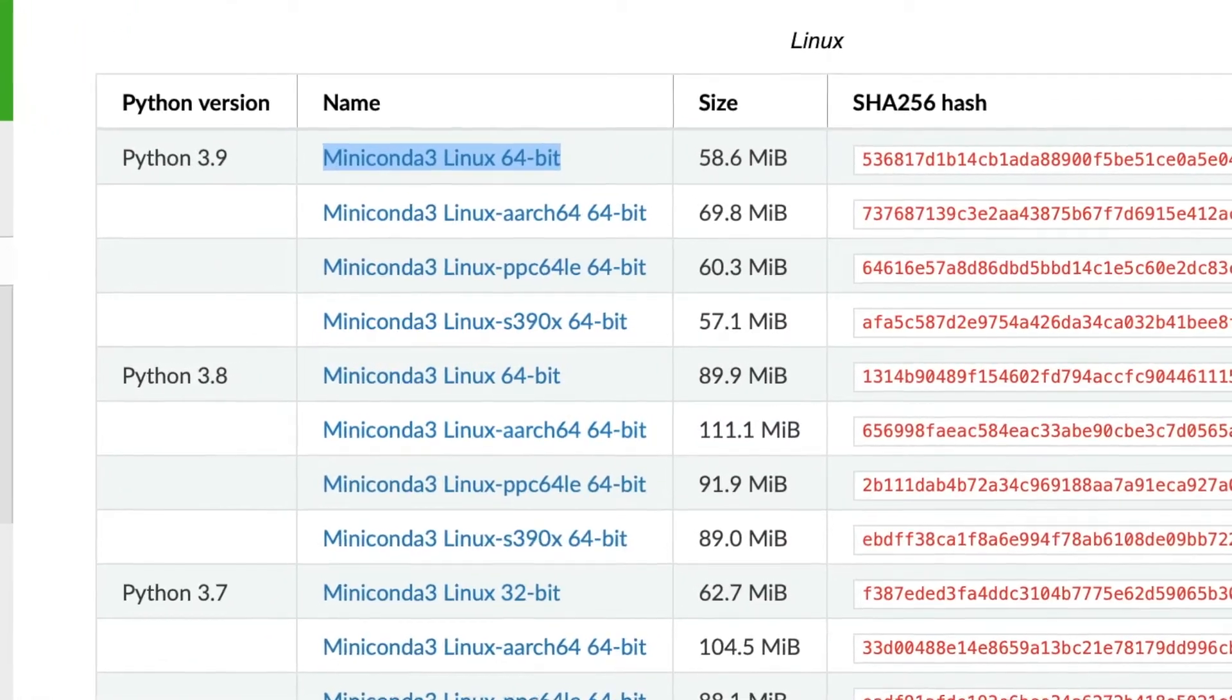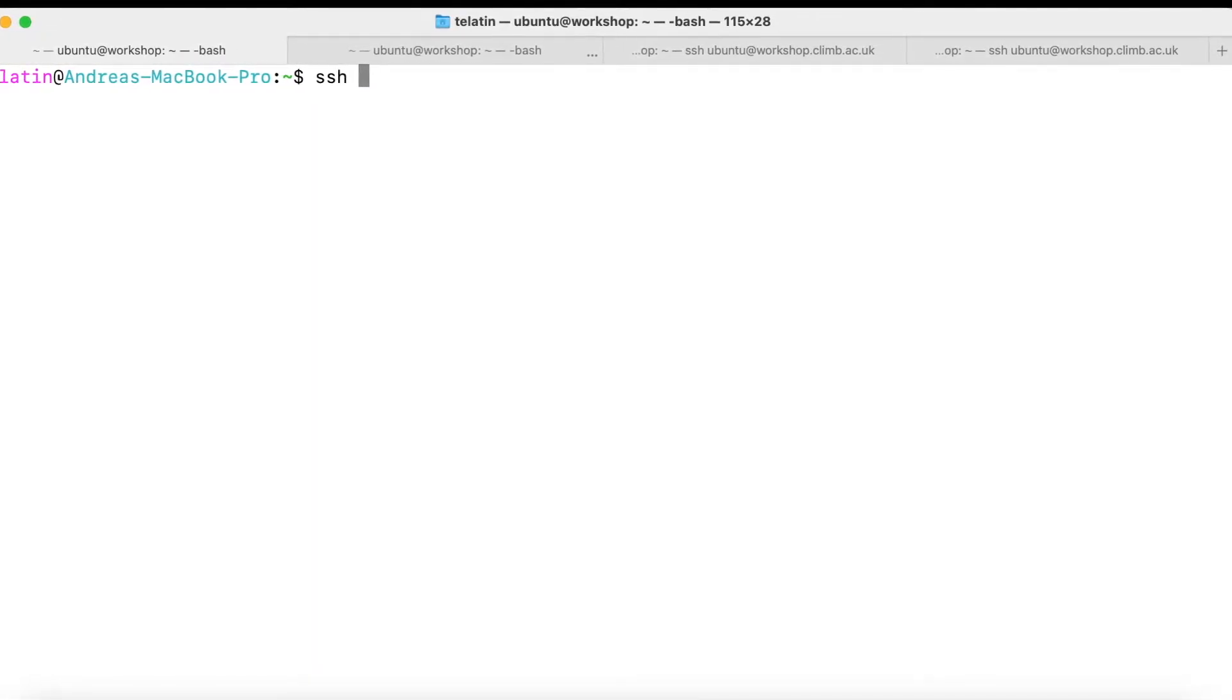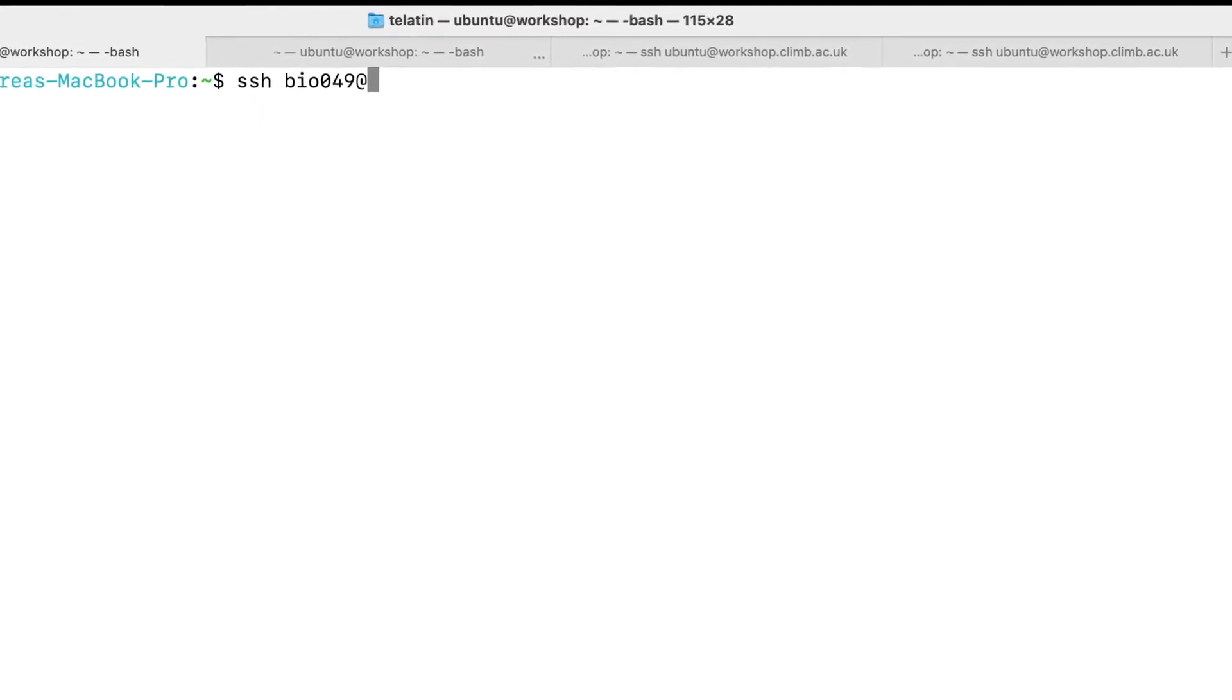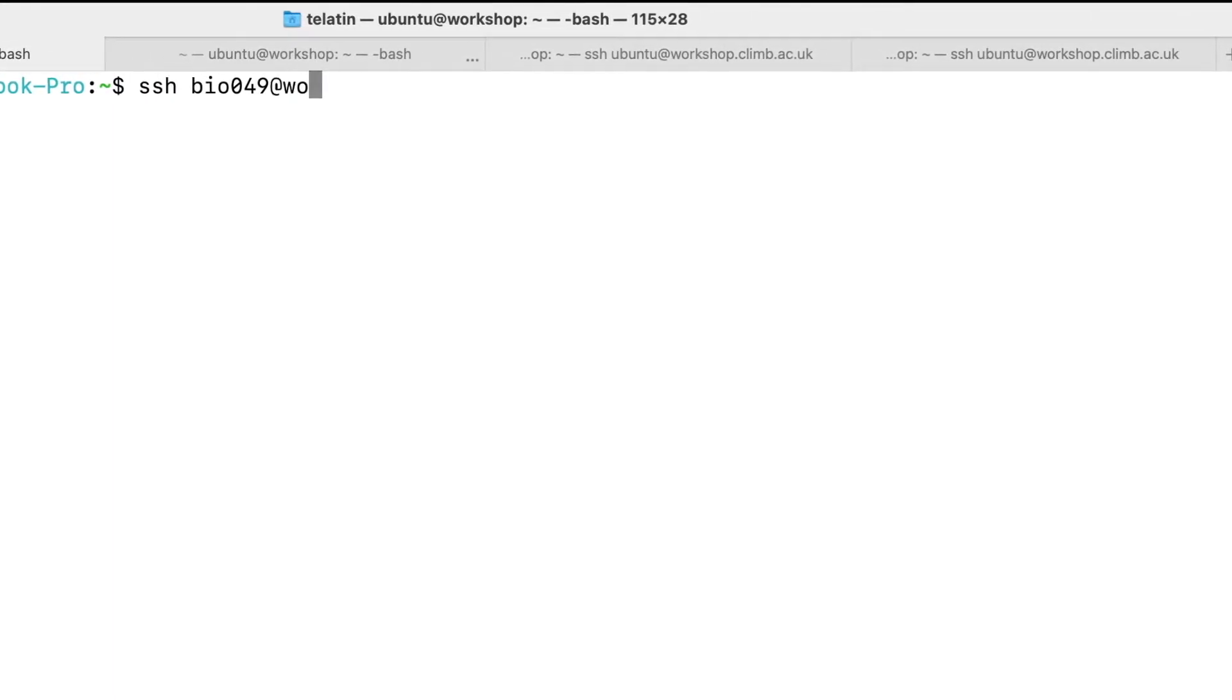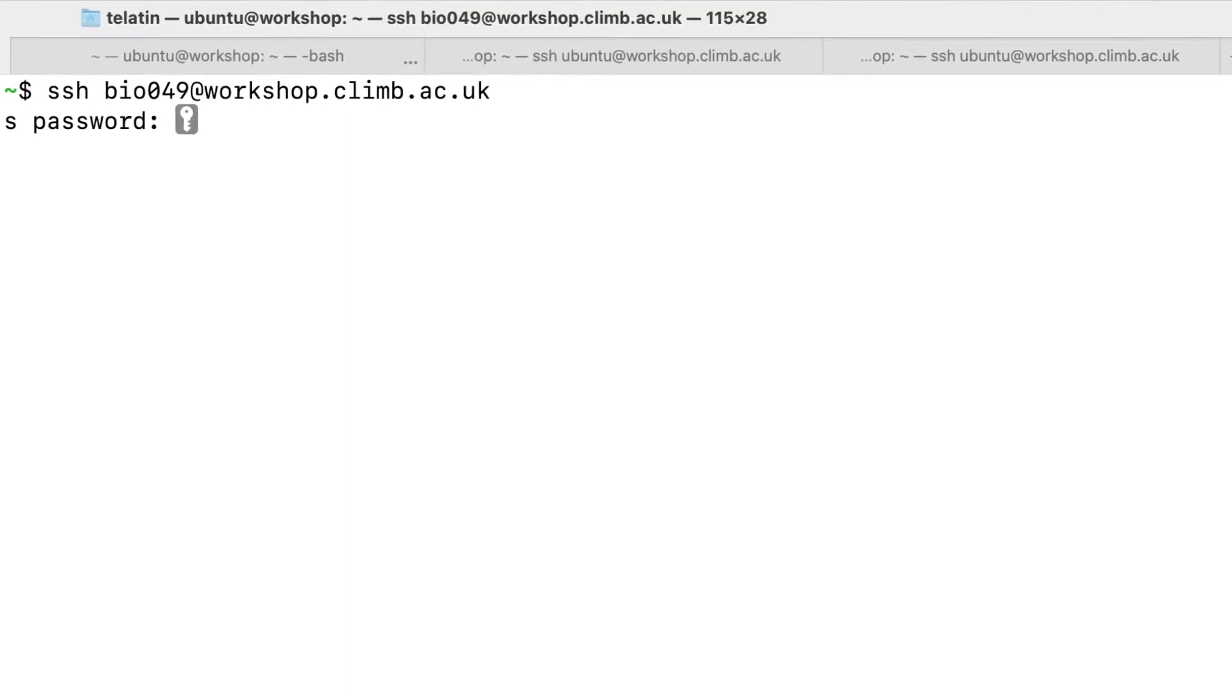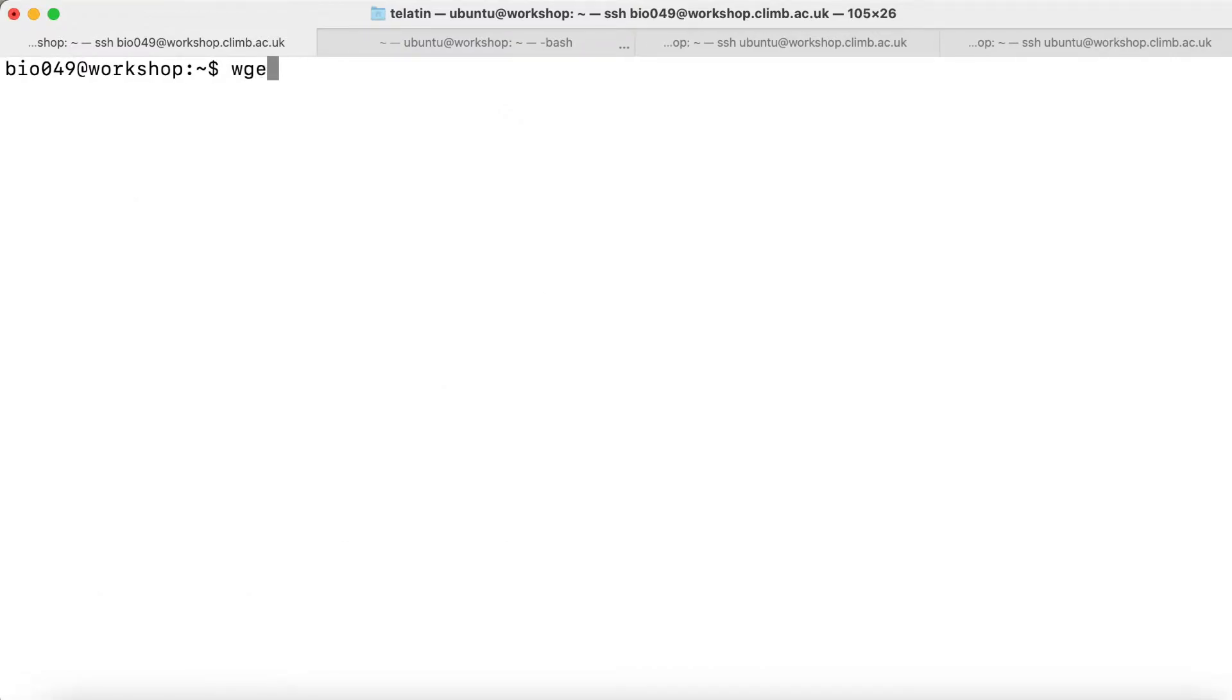Let's login into our remote server with SSH username at the remote server address that can be either a URL, a domain, or an IP address. In our case we have a nice workshop server. We can paste the password, or type the password, and we are in. With wget we can paste the link.